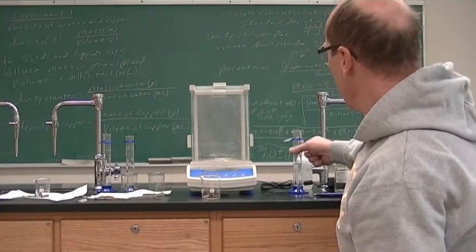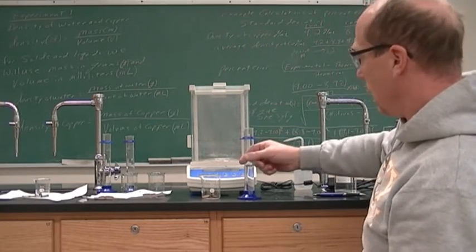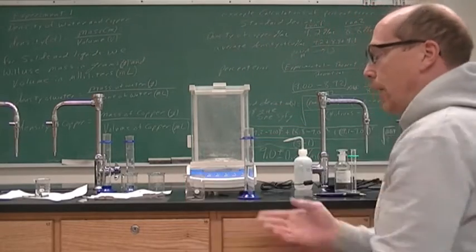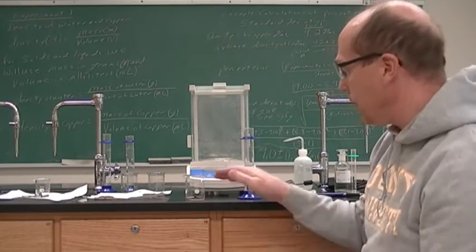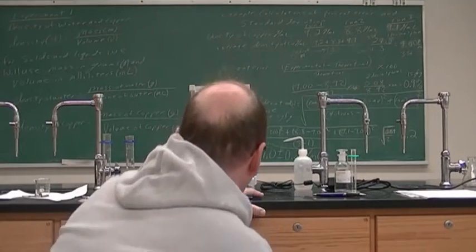And so you have to figure out how to get the mass of the pennies from those two data points. All right, so we are here with our pennies. Now we have the mass of the pennies. You can easily calculate the mass of the pennies. All right, and so now again, we check our volume.